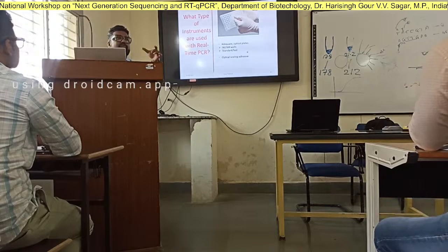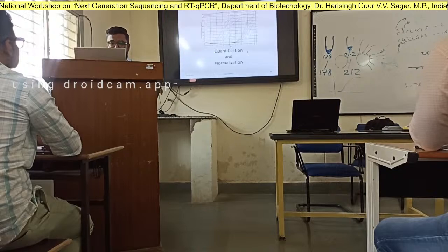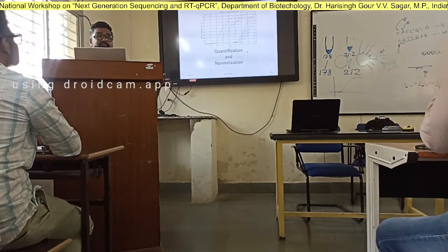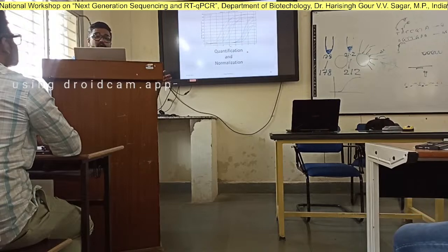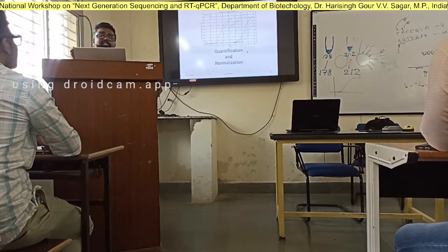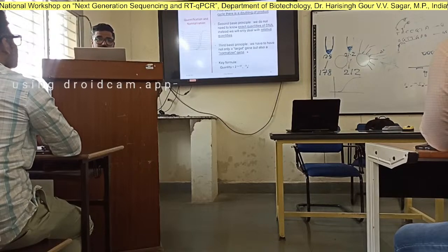Now we were saying there's one more aspect of quantification. Once you are done with the technical aspect of primer designing and assay designing, one more aspect comes, like quantification and normalization. So once you know this is my target gene, you study. It's not easy to just take your target gene and press it, right?